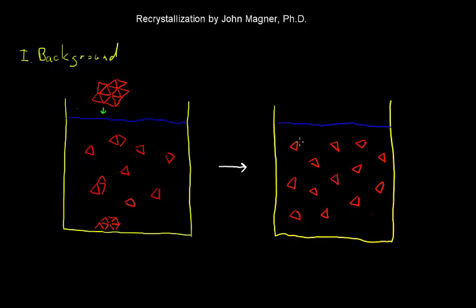So these concentrated particles begin to agglomerate again, begin to form solid particles, begin to stick together, and you reform the solid. That is, you recrystallize. So we began with crystals, we dissolved them, and now we are ending up with crystals. That's why this is called recrystallization. And the way this appears, if it's ideal, is this will get cloudy, and you'll begin to see solid particles form. It's almost like snow, the little particles that fall. Sometimes it's not quite that nice, but eventually you get crystals accumulating on the bottom of the container again, solid crystalline material.